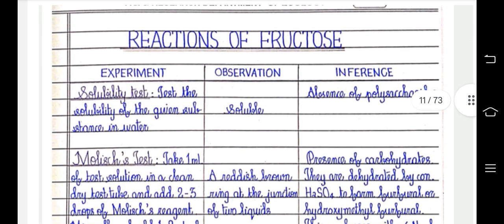Next, reactions of fructose. To a greater extent, it is similar to glucose, but still we are going to learn this. First, we will be performing the solubility test. Test the solubility of the given substance in water. It is soluble, so that indicates absence of polysaccharide.